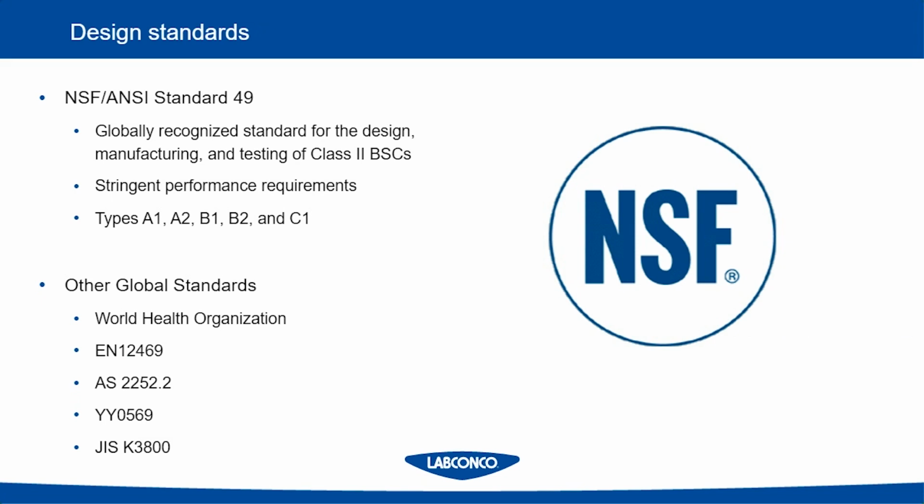Okay. Now, when it comes to our manufacturing design standards, LabConco manufactures various types of Class 1 and Class 2 biosafety cabinets, as do other manufacturers. How do we know how we need to make these cabinets? We are held to a standard that we all refer to as NSF 49. This standard is put out by NSF and ANSI International, and it relates to how we design, make, and test our biosafety cabinets.